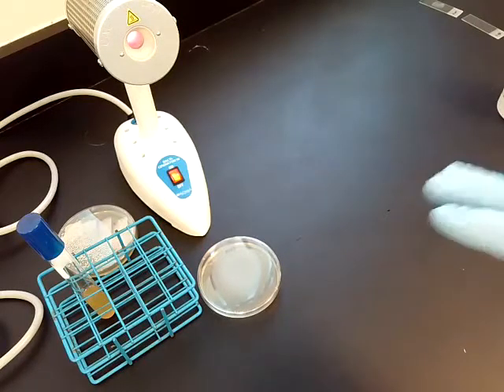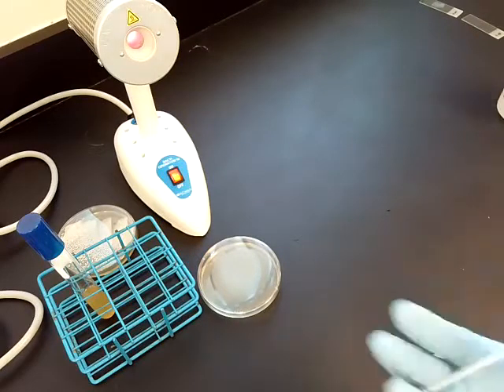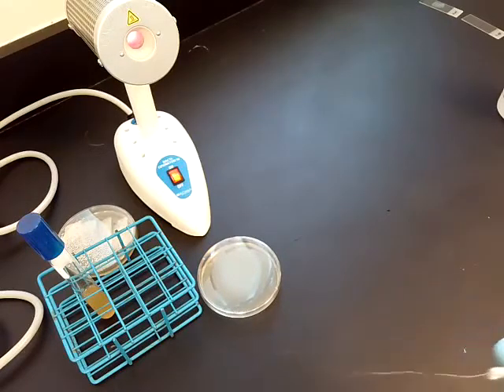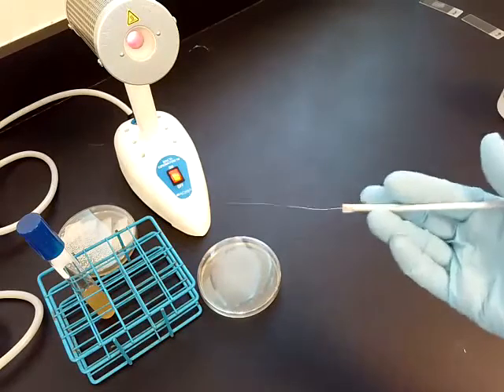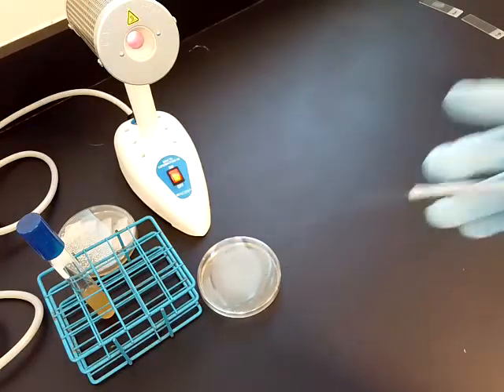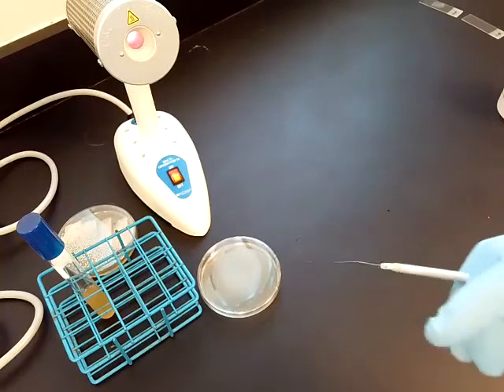All of the cells inside of a colony are essentially genetically identical because they should have arisen from the cell divisions of one bacterial cell. And that makes it a really useful diagnostic tool. Then we can look at individual colonies and start to decide which one looks weird, which one looks normal, and which one do we want to pay a little closer attention to in order to diagnose the infection.